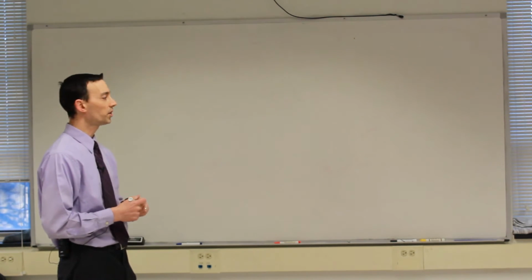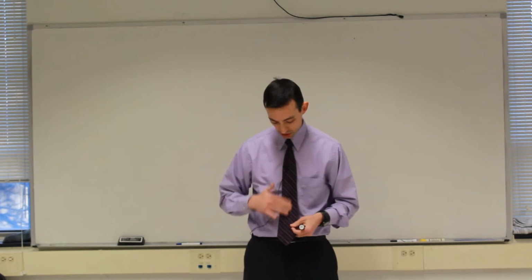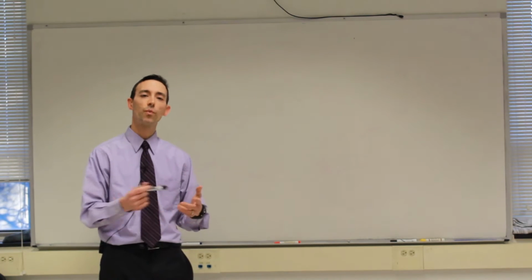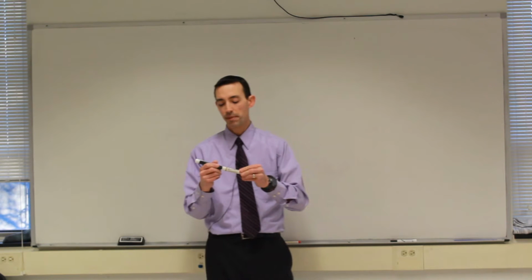While your reaction occurs today, you'll literally see your system start with a nice deep purple color like my tie. But over time, as the dye molecules react with hydroxide ion molecules, they will bond together, just like me putting these two pens together, and the new product is no longer purple in color.